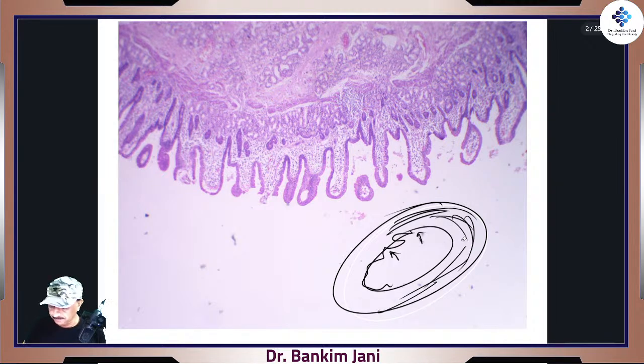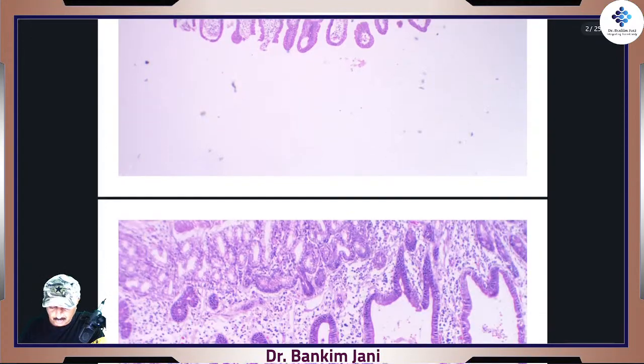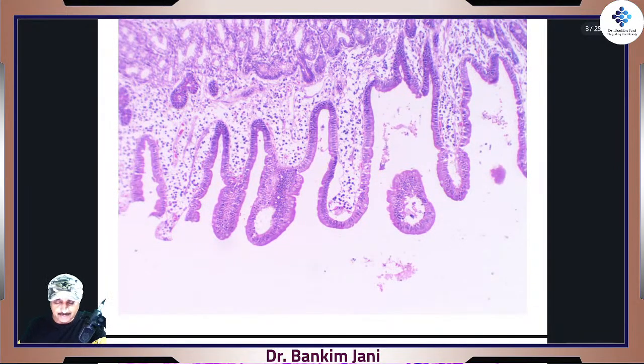Things look quite simple at this point. We need to zoom further because this is just 10x, right? Yeah, lumen, very right, lumen. Let's move into higher magnification. And suddenly things look so nice, right? Such a decorative thing, right?